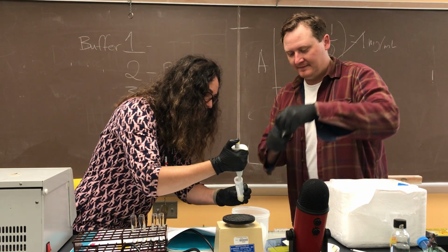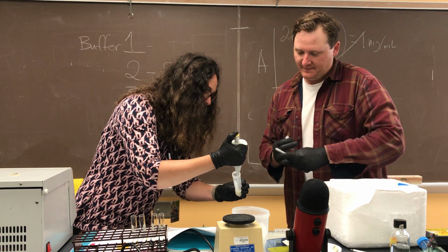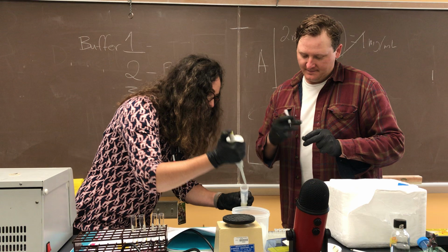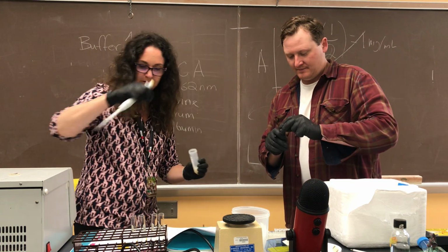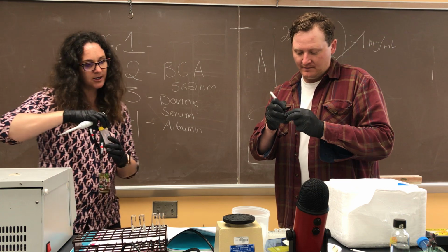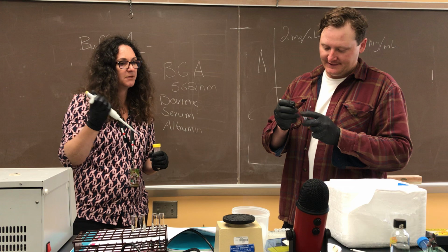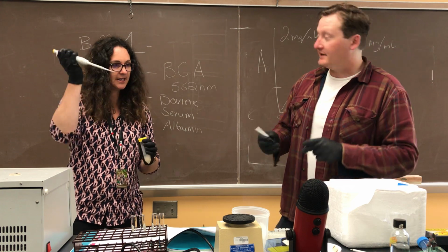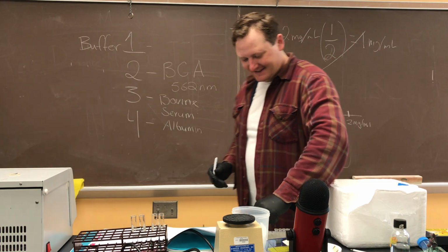1, 2, 3, and 4. So we're just going to number them 1, 2, 3, and 4, which will correspond with the 4 extraction buffers. Okay, always this has E. coli on it, so I'm going to put it in the biohazard bin.